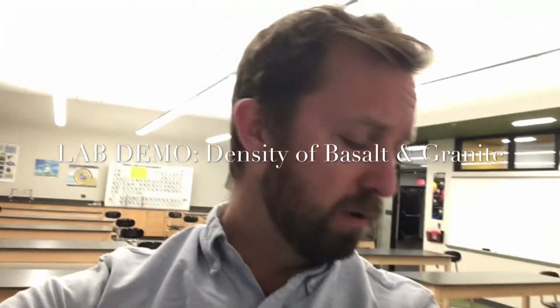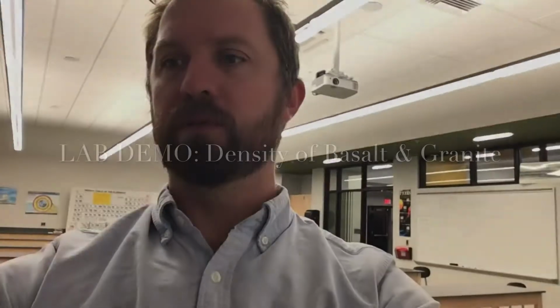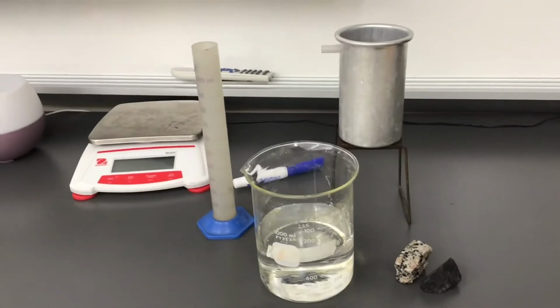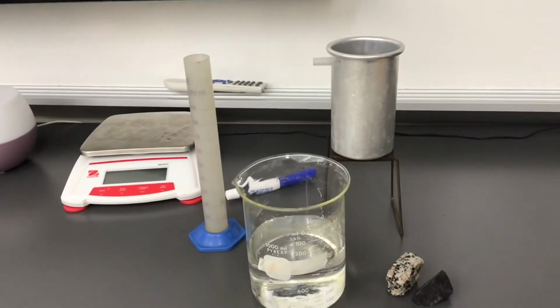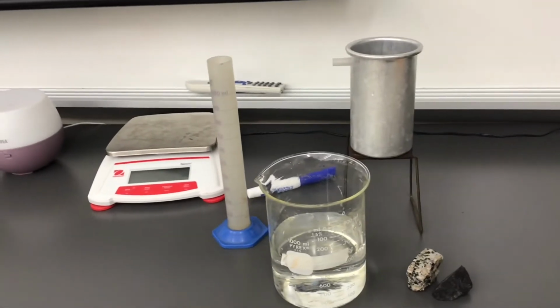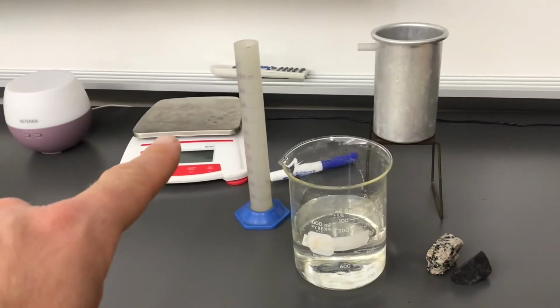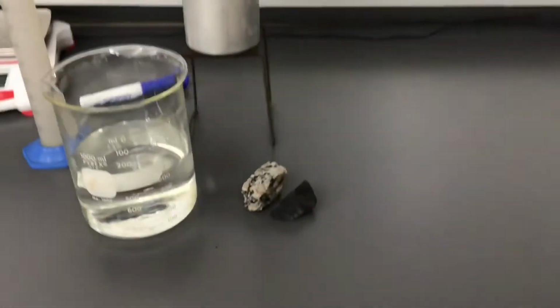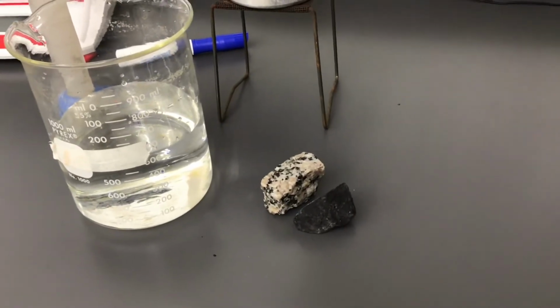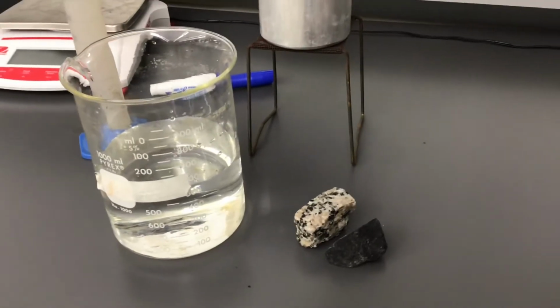Okay, so what I've got here, I'm going to switch the camera to show the opposite view. Just a second. What I've got here are all the parts of the lab that we'll need. A couple different things for you to have at your setup. You've got a beaker of water, you've got a graduated cylinder. You've got your scale here, and you've got two samples of rock. We've got granite and basalt, and they're all a little bit different sizes. So we need to find the density of these two rocks. That's the whole purpose here.